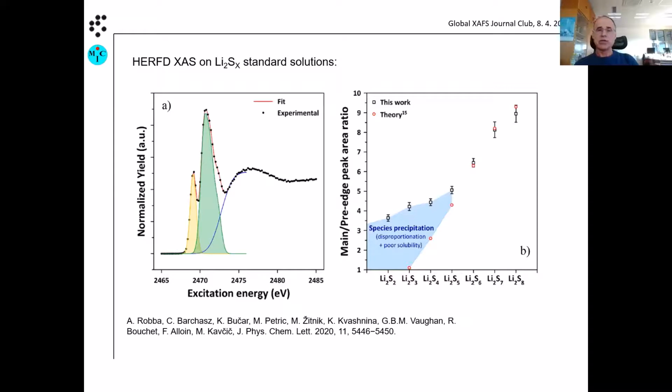But usually we don't do such measurements, to compare the intensity of lines at very different angles. In our case, we sit in one position, so we don't move a lot. And then these variations across the detector are very, very small, so we don't even consider that usually. Okay, thank you.